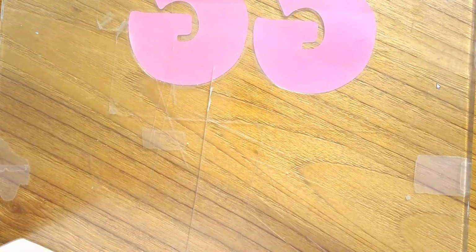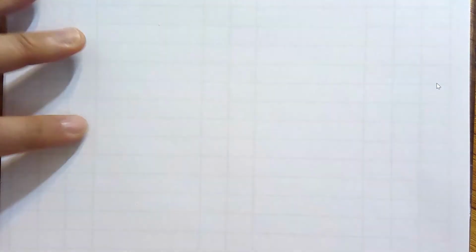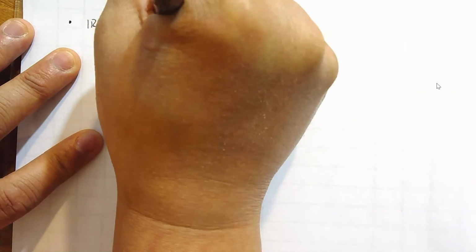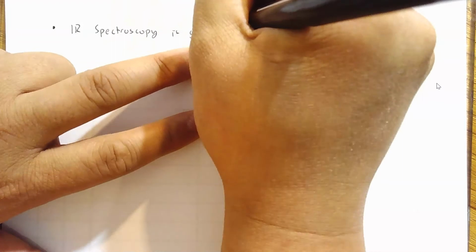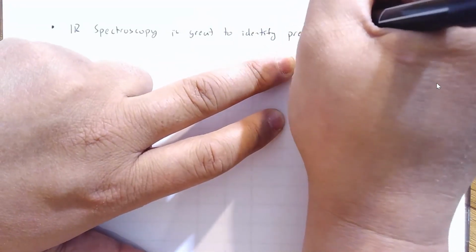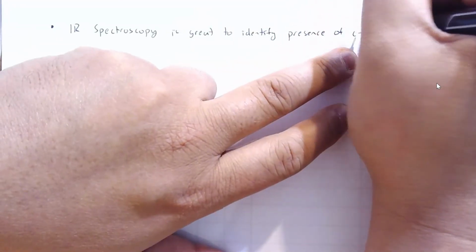Because recently the term functional groups has changed a bit. And if IR is used to identify functional groups, we want to make sure that we are talking the same language. So again, IR spectroscopy is great and easy and fast to identify the presence of certain functional groups.